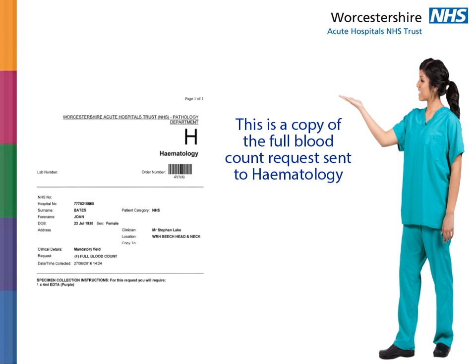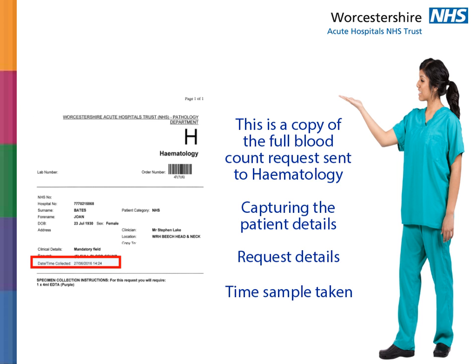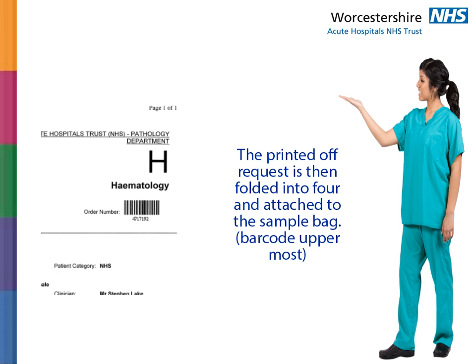This is a copy of the full blood count request sent to hematology, capturing patient details, request details, time sample taken, and any special instructions. The printed off request is then folded into 4 and attached to the sample bag, barcode uppermost.